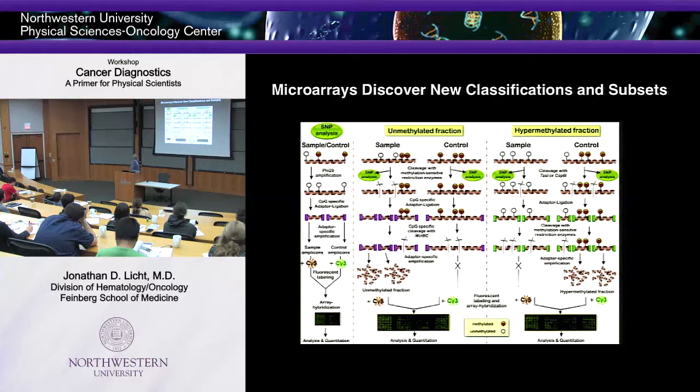Another technology you can use is, we talked about the expression of the genome. We're expressing RNAs, microRNAs, long non-coding RNAs. Underlying that are epigenetic changes, which is a big focus of our PSOC, of course. And a lot of those epigenetic changes are changes in DNA methylation. And you can actually profile DNA methylation by a microarray approach.